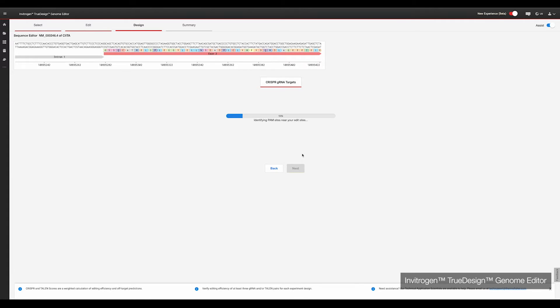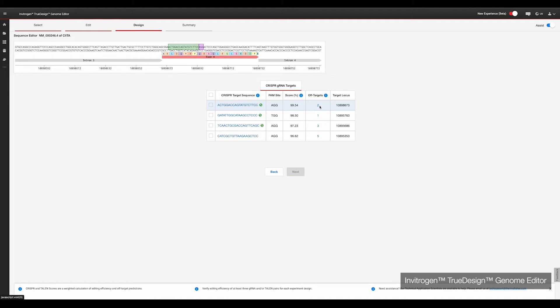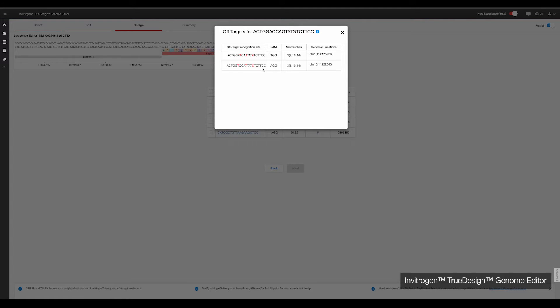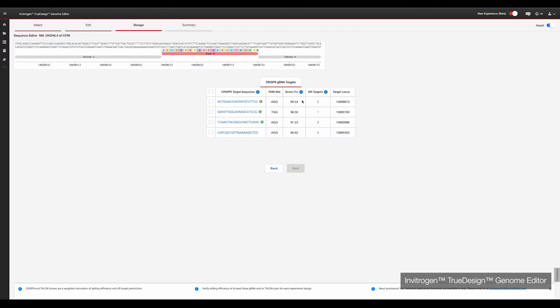Clicking next initiates TrueDesign's algorithm, which will scan the desired edit site region for all proto-spacer adjacent motifs, or PAM sequences. It will then rank the recommended gRNAs for performance and specificity, and filter out those with poor off-target prediction. If the site you are targeting lacks PAM for CRISPR, TrueDesign will design TALENs to target the desired edit site. Clicking the off-target number gives you a list of the possible off-target editing sites. However, just because an off-target is listed, it does not guarantee the edit will occur, especially if your gRNA has a high performance score. Overall, a gRNA with a high score and a low off-target number is ideal.